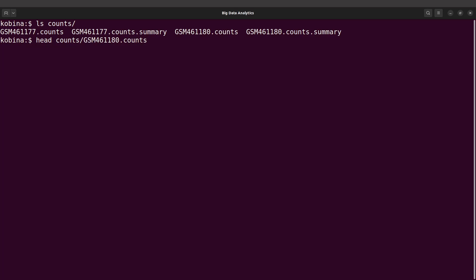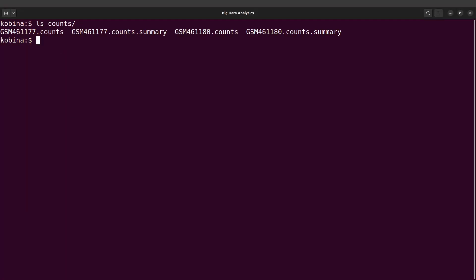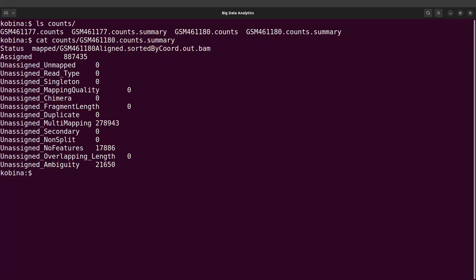I'll do a head on the counts file since there's a lot of information. Let's also look at the summary. I'll say cat counts/GSM461180.counts.summary — that gives you the summary as well. I repeat: you can also view this file using spreadsheet software, which we will do later on in the tutorial.